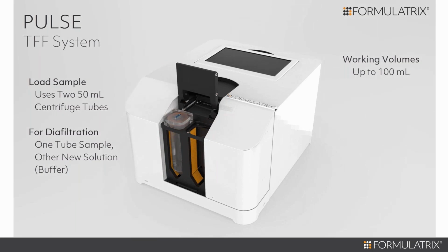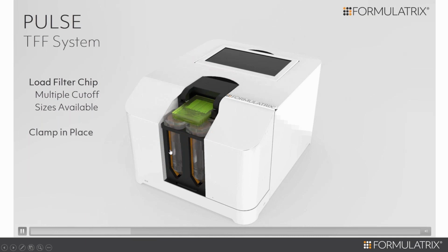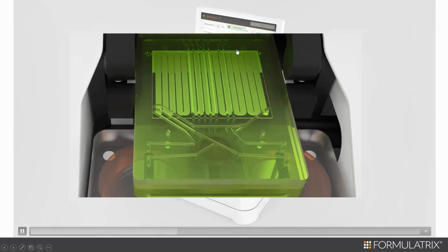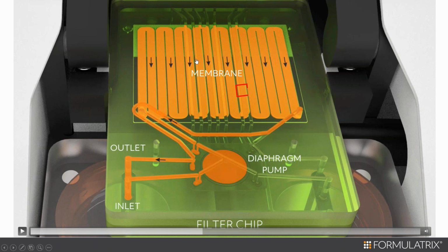So this is how you would load your 2 Falcon tubes, and we can take from 50 ml to 100 ml solutions. This is the membrane that fits on the top of the Falcon tubes, and this is the LED screen, which is based on Raspberry Pi basically, and you can program your protocol cycles using the UI here. So the protein sample from the Falcon tube gets aspirated into this and flows through this membrane, and it gets filtered out. And of course, these membranes are available in different sizes, different cutoffs.